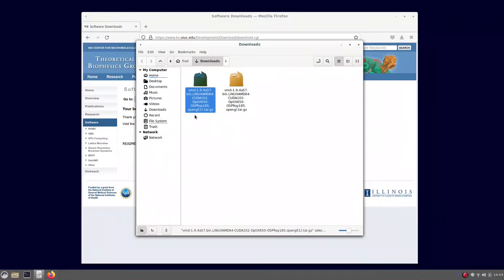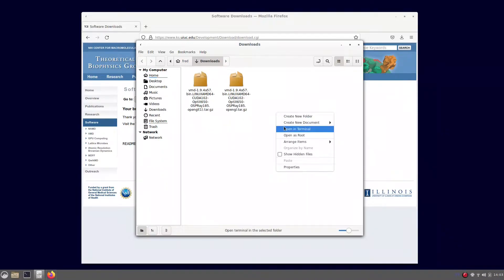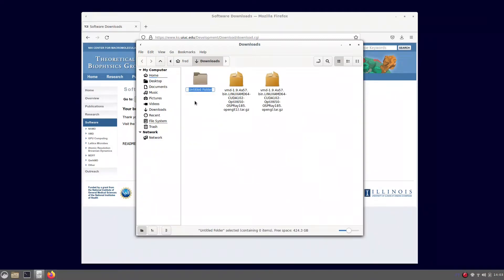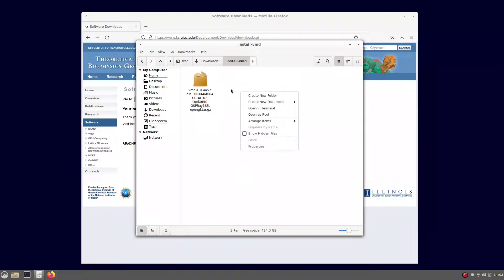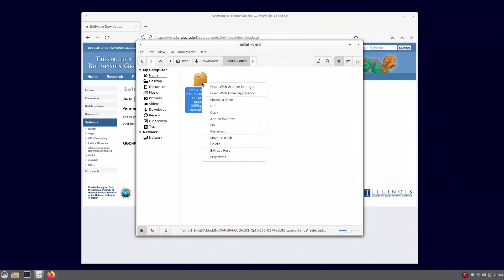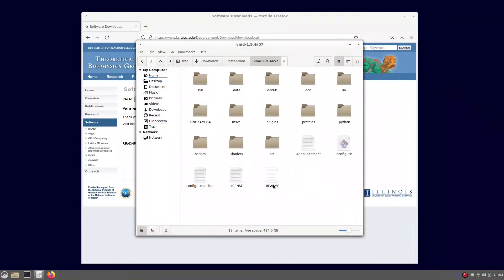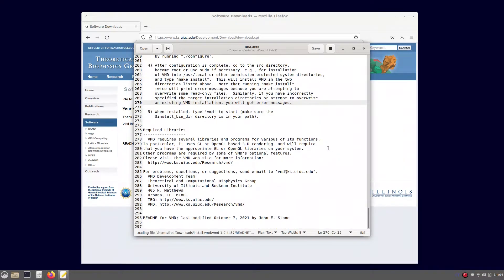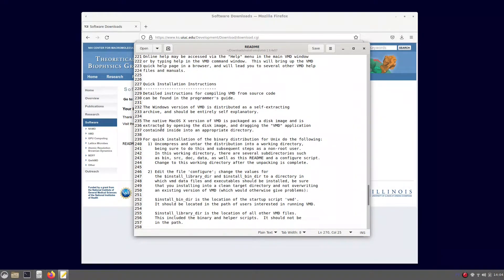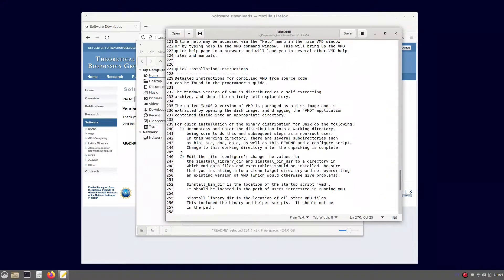I already have downloaded it before, but it's okay. To keep things nice and organized, let's create a new installation folder and move the VMD package to the new folder. The next step is to uncompress the package — you can do that either by using the graphical application or through the command line, and both will work just as fine. Just make sure that all the files are there and you have uncompressed it correctly. Looking at the README file, the first instruction is to uncompress, which was done, and then we have to edit the CONFIGURE file.